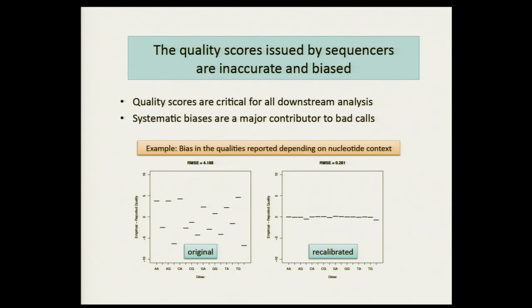So you read the A followed by another A, and I'm showing you the estimate of the quality of that second A. Okay. All right. So you can define it any number of ways. What's beautiful about this software package is that you can write up a little Java class and write any covariate of error you'd like. If you care about the trinucleotide context instead of the dinucleotide context, it's very easy to investigate those sorts of things. You simply write a little Java class, throw it in, and then you'll get plots. It'll actually make plots for you of the trinucleotide context.